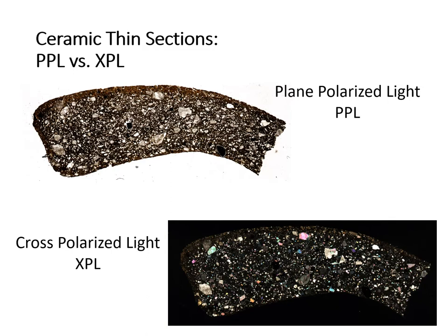This is what an entire ceramic rim sherd looks like in thin section. On the top, you can see the entire sample in plain polarized light, and on the bottom, you can see the sample in cross polarized light. In most cases, however, we are viewing a much smaller section of the ceramic underneath the microscope.